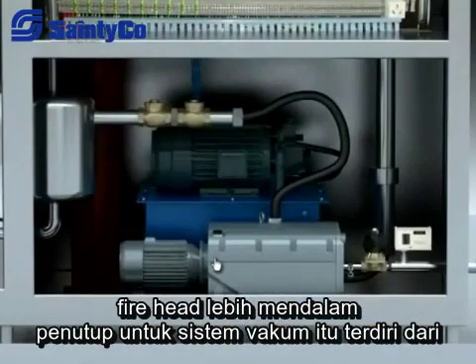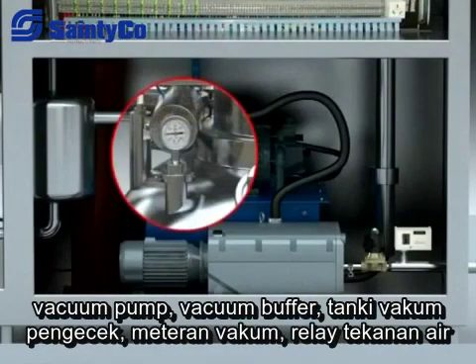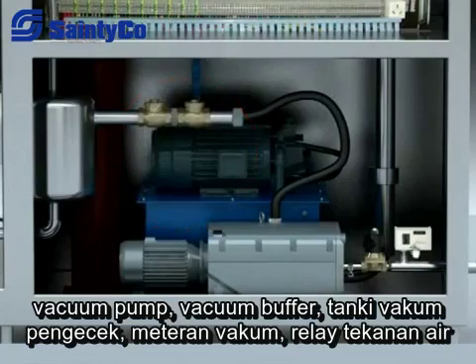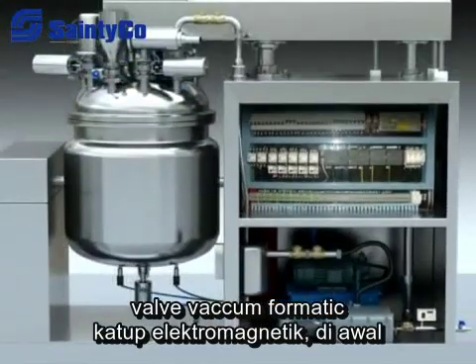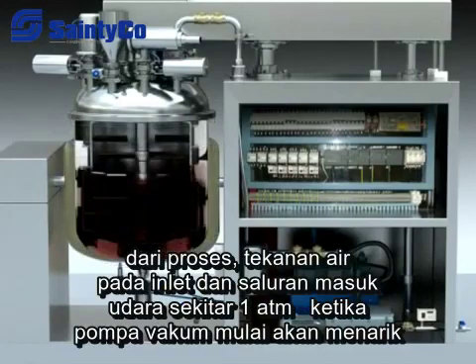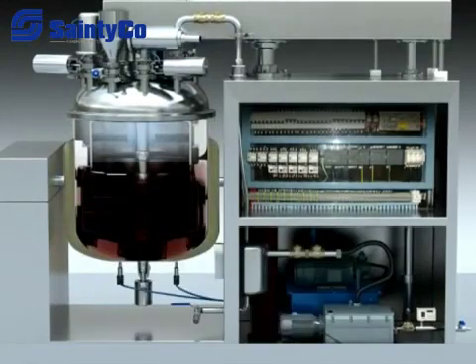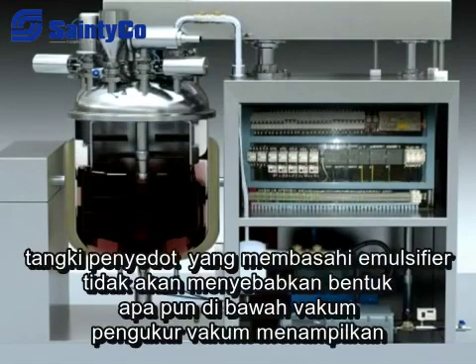The vacuum system is made up of vacuum pump, vacuum buffer tank, check valve, vacuum meter, water pressure relay, vacuum pneumatic valve, and water electromagnetic valve. At the beginning of the process, the pressure at the water inlet and air inlet is around 1 atm. When the vacuum pump starts, it draws the air in the tank through a pneumatic valve, check valve, and vacuum buffer tank.